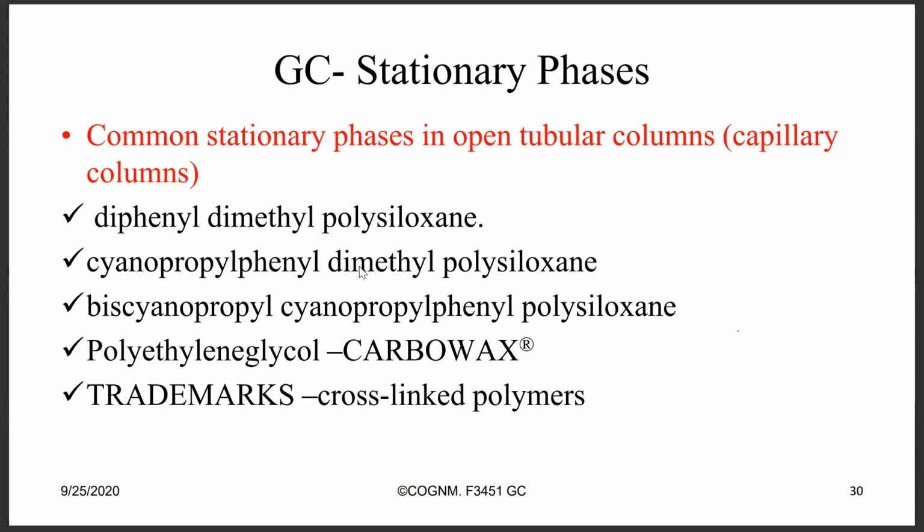Stationary phase, thinner, very thin profile, carbohydrates, pigments.